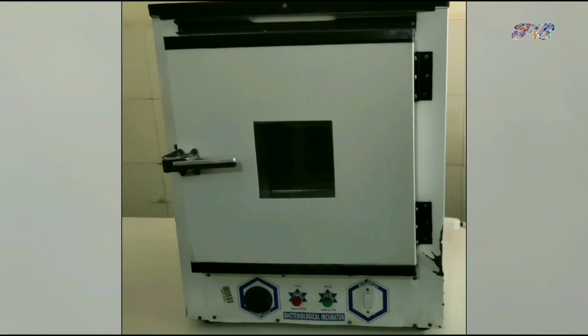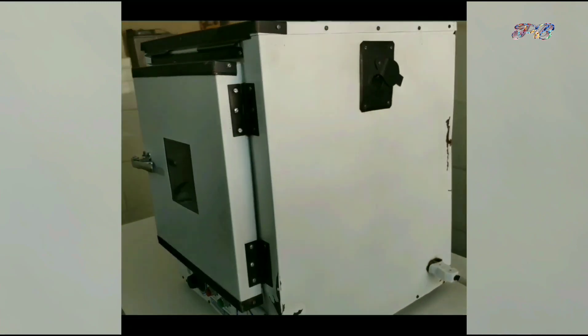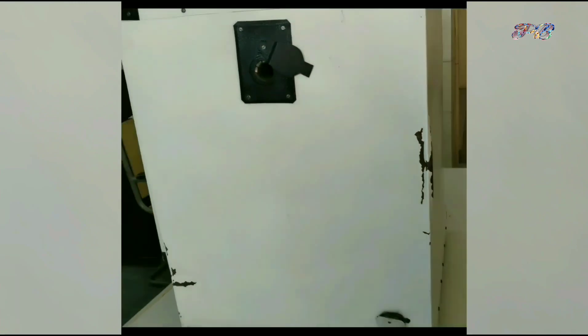Hello friends, welcome back to Brehmpathia. In this video we are going to introduce another laboratory equipment — the incubator. It is used in both biochemistry and microbiology.